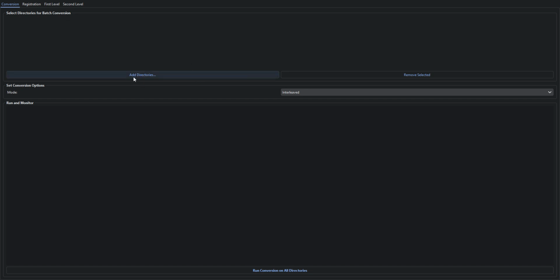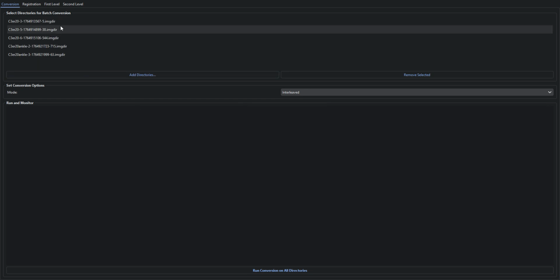So first thing you want to do is, of course, add the directories here. For one, I put the directories in work, Phasor Handler. Okay, so I got some test data here. This is from Yi. Some really nice test data. So I'll be doing it all for all of this. As you can see, there's 5 of them.